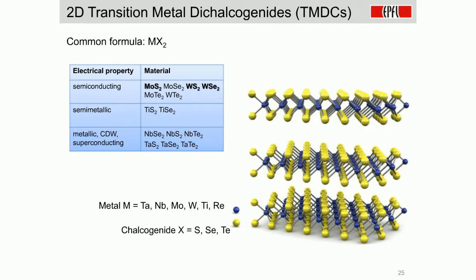So we focus mostly on the semiconducting ones in our group, and I will today only be showing examples on molybdenum disulfide, which happens to be the most robust, so we can do a lot of long studies in AFM without worrying about things like degradation and oxidation, etc. And towards the end, I'm also going to show some results on graphene ribbons, monolayer and bilayer graphene.